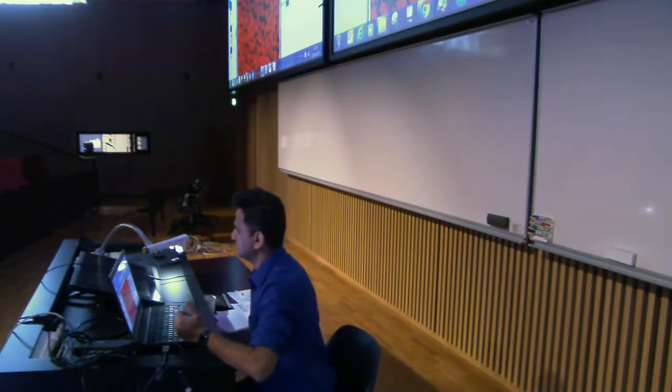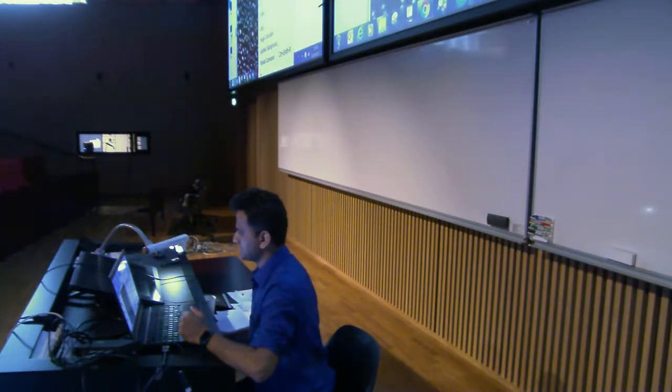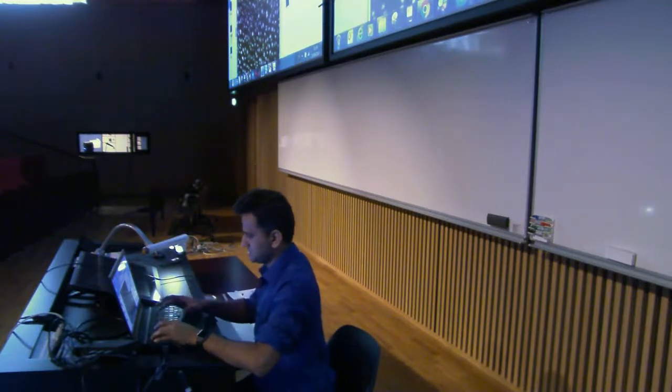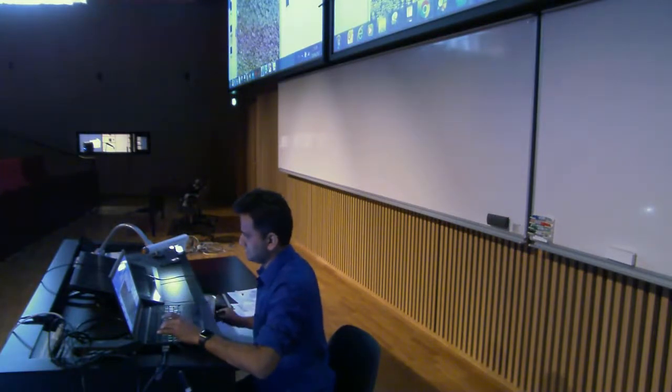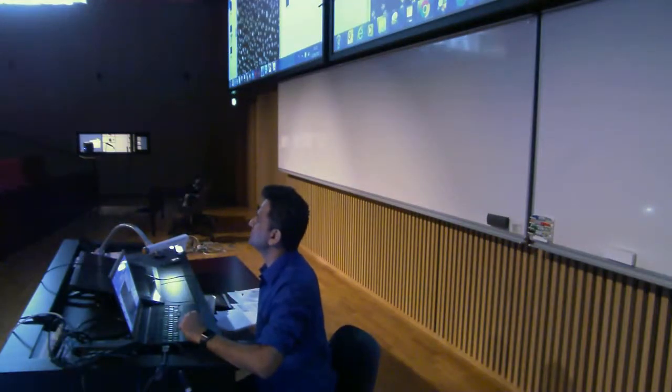Then you might have to consider doing some pre-processing, which we did actually before. You can also go process and say find maxima. Just go for preview, single points, 7 maxima. Change this to 10. See, these are the maxima that's coming up. Not light background, that was my problem. So now it's coming, okay?